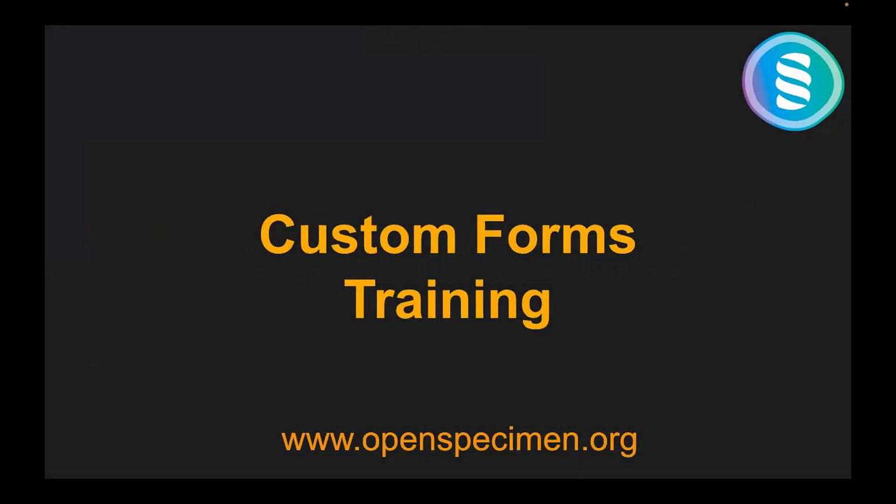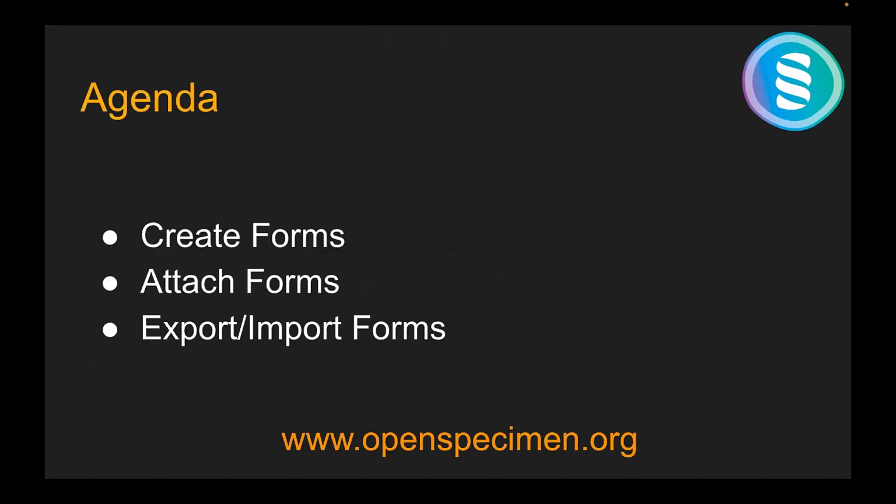Today we are going to cover custom forms training. This is the smallest amongst the entire lot. The primary idea is not to create multiple forms over here based on the custom requirements, but to show what all things are possible within OpenSpecimen and how they can be explored more. So today we will be covering these three things primarily.